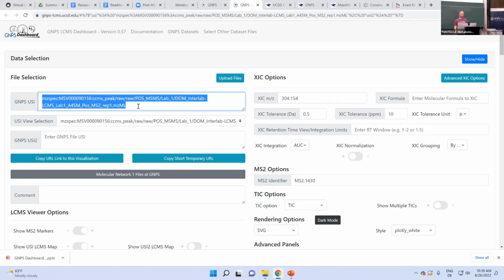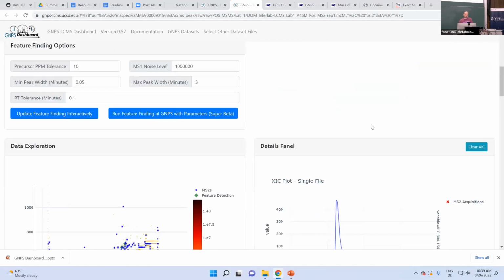By manipulating these URLs, I could load in more files, and then with that middle selection thing, I could jump between them and visualize, because it only visualizes a maximum of 2 at a time, right? But at the end, if I have multiple files divided into groups, I can make use of the integration and directly show peak area in the box plots. But for now, unless there are more questions, let's check out the feature finding results.